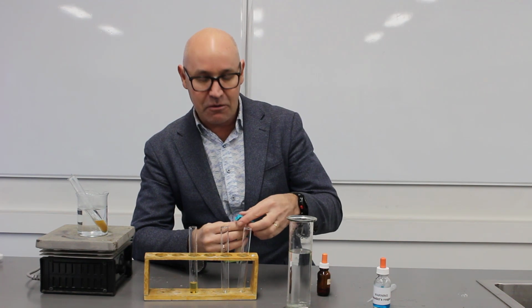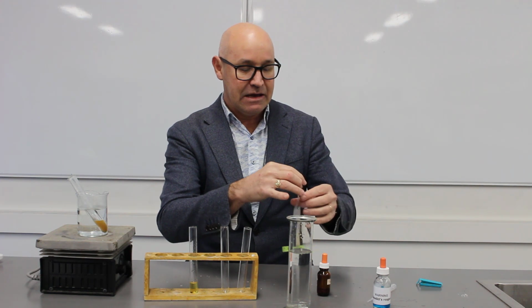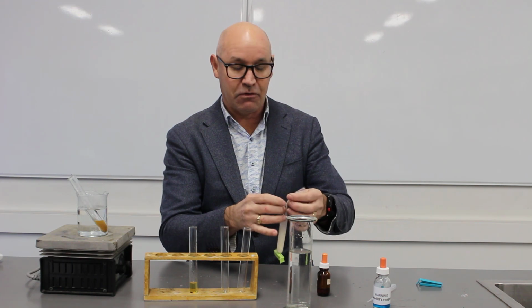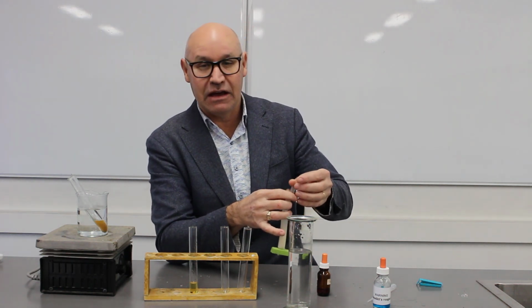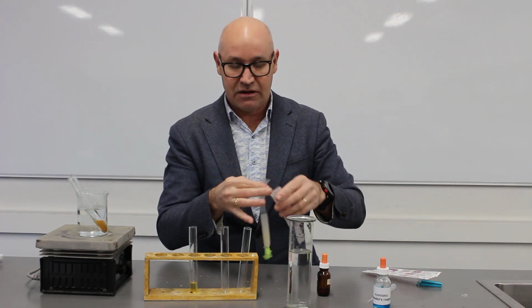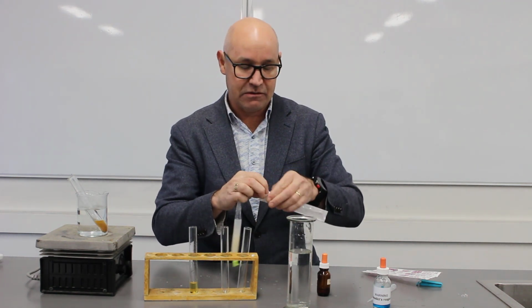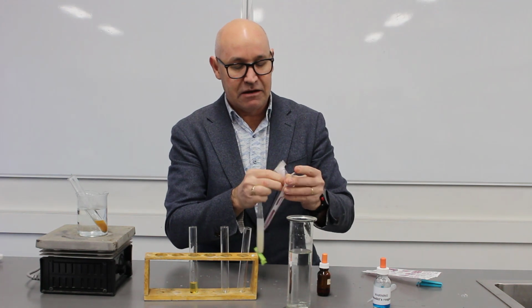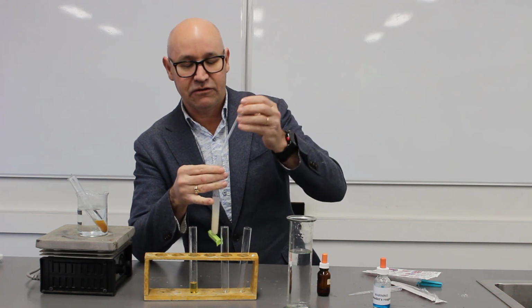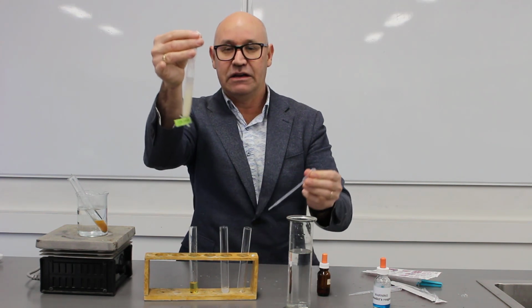I thought one more thing we might do is very carefully open up our bag, and we'll get out some of the solution, and do one more test for starch and for glucose with the Benedict's test. I probably should have opened this up first. Again, brand new transfer pipette, 2 brand new test tubes. Okay, so do you think there might still be starch in there? I mean, look how cloudy it is.